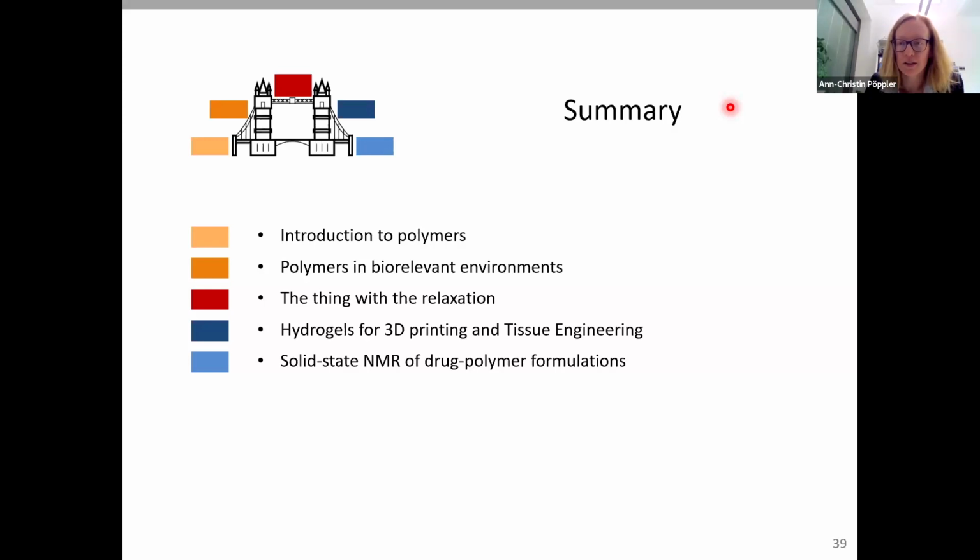What is difficult is we are currently saying that all the long alkyl chains, we can't separate sufficiently between them. So for some species, there are individual functional groups like double bonds, for example, in the backbones, and then they are nicely separated and we can analyze them, or the methyl groups for the taurocholate.